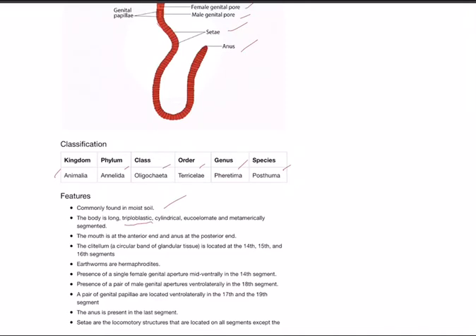Triploblastic means three layers are present in the embryo: ecto, endo, and meso. The body is cylindrical, eucoelomate, meaning truly coelomate, and metamerically segmented, meaning the body is divisible into segments. The mouth is at the anterior end and anus is at the posterior end. The clitellum is a circular band of glandular tissue located in the 14th, 15th, and 16th segments.